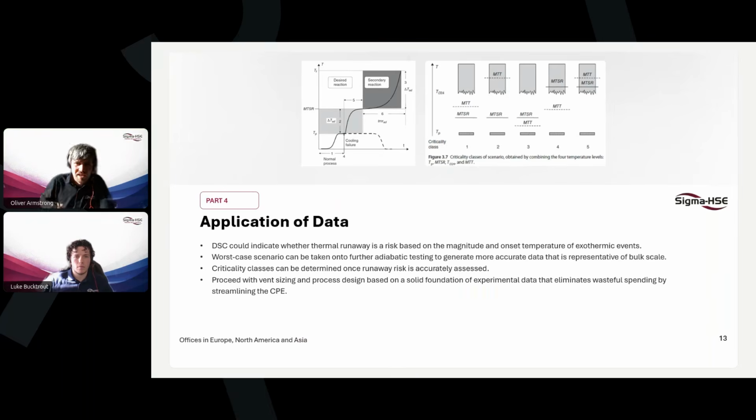So doing this early stage screening and different kinds of assessments by DSC really allows the testing program that may require different adiabatic methods and reaction calorimetry later on to be vastly reduced in scale and more targeted on the key scenarios that will ensure safe process development.